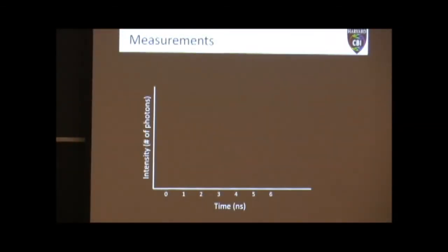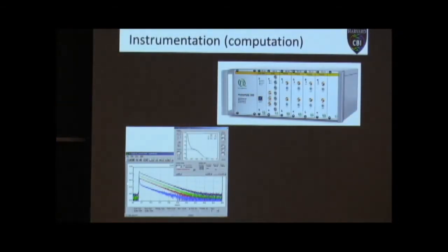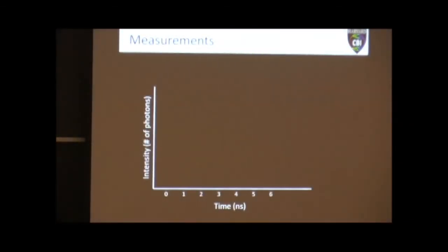So what does one of these measurements look like? You saw a little bit of an example of it down here. Most FLIM data that you're going to see is just going to look like this simple graph right here. You're going to get a quick uprise and then a slow exponential decay. What is that? Those graphs, for the most part, have the intensity on the y-axis, which you can think of much more easily as just the number of photons in the detector. And then along here is the time axis, which is usually in nanoseconds.